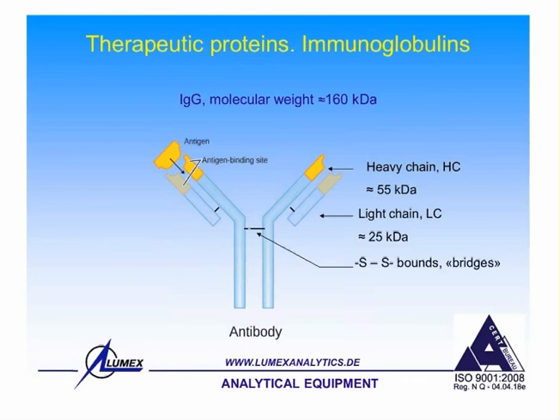But if you want to save time, you don't do it. And then you need a streaming potential to be absolutely sure that even if you rinse the capillary just with a buffer between analyses, it is still enough to make the analysis. If not, then either you need to wash it with sodium hydroxide always, or you need to apply streaming potential. I think I answered the question.